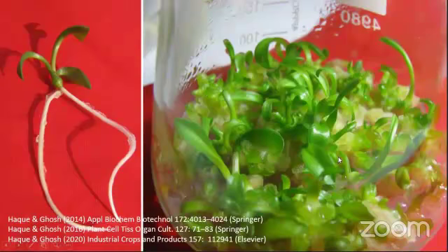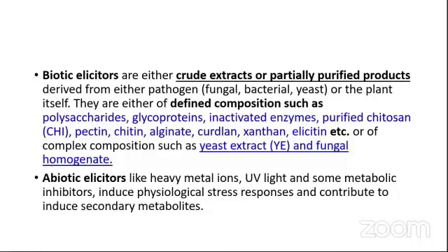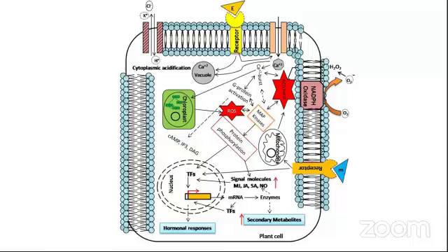A huge number of plants are growing in the liquid flask culture media. Another aspect is the synthesis, or inducing or enhancing the synthesis, by elicitation with elicitors. We treat with both biotic elicitors and abiotic elicitors, which can induce through their signal, used as signal molecules through their signal transduction pathway. They are used as a defense because the plants start their defense mechanism for more biosynthesis of more active compounds.